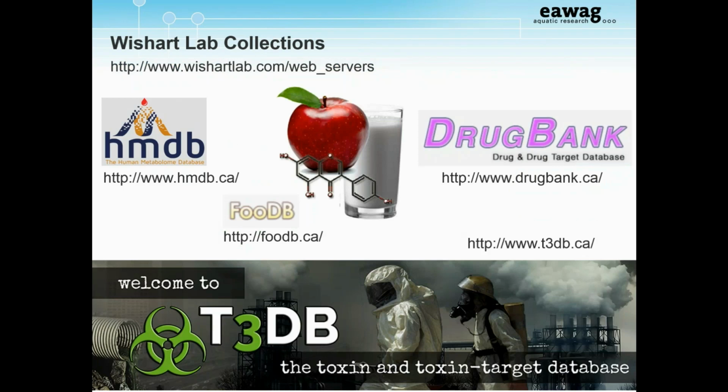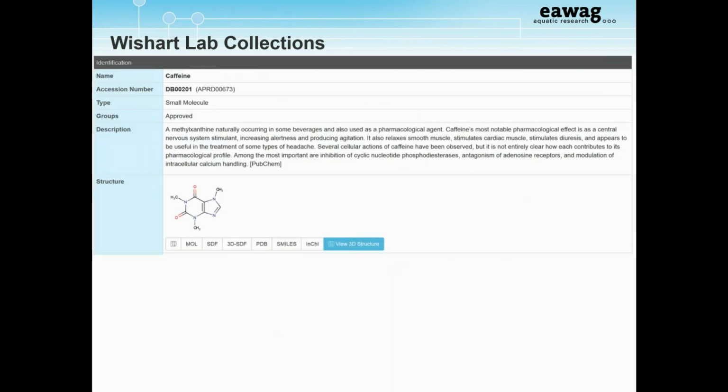The Wishart Lab has actually a great number of different web servers. I've just selected a few of them. So HMDB is probably the one most likely familiar to this audience, the Human Metabolome Database. They also have DrugBank, FooDB, and T3DB, and several others. What's nice about their collection is they actually have all of their information on cards. So if you want to find out a lot of information about a substance, this is mainly what these resources are designed for, and the spectral information is an added bonus. So their main function was not necessarily a spectral library, but they offer some nice data.